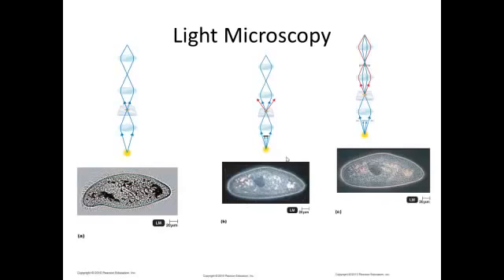Now, this next one looks very similar to the dark field, but you'll notice there's a little more color. There's a little more definition along the edges. This is a phase contrast micrograph. Once again, we start messing around with the light waves to provide contrast or shadowing. We do this for approximately the same reason that we use the dark field: to look at live organisms, to look at organisms without having to stain them if they're too fragile to be stained. Also, we get a better picture from a phase contrast microscope than we do from a dark field, but the dark field is less expensive.